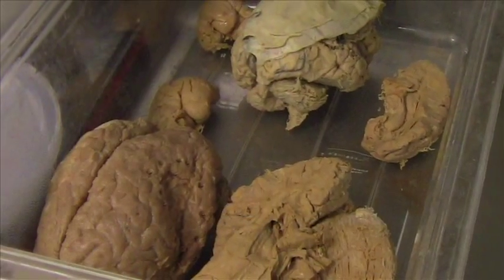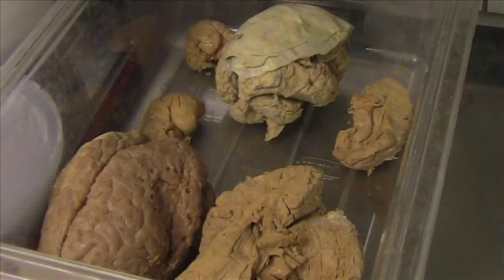The plastination process is a really useful tool for us to turn items that were once living tissue into something that is more like rubber now and long-term durable plastic.